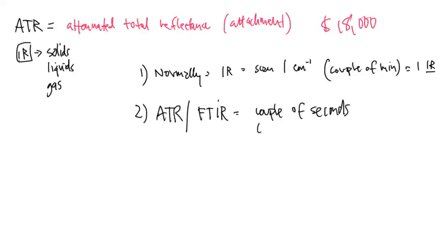It's actually so quick that this combination can easily produce an infrared spectrum in such a short amount of time that by default it does around 45 scans, and it averages all of those 45 scans together to give you one infrared in total.